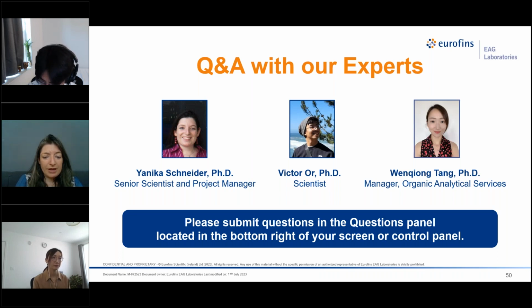Okay, so the next question is for Victor: does NanoIR have acceptable repeatability for characterization of organic layers on an inorganic material? So repeatability of NanoIR is actually a really interesting question, because you have 3 factors that account for the signal.